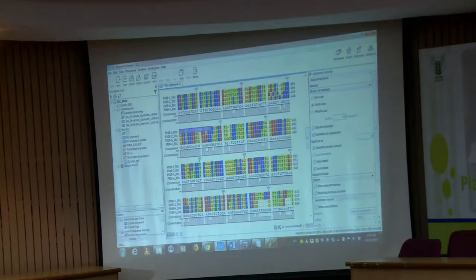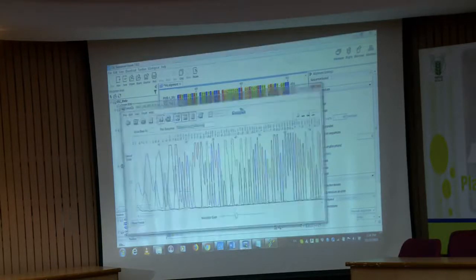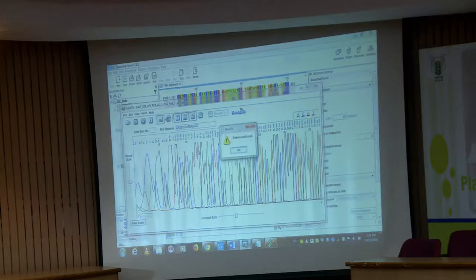By right click, you can copy it, go to Finch TV. Actually, this is some other file, so it may not highlight over here. So, paste it over there, then say enter, okay. Pattern not found because this is something else.